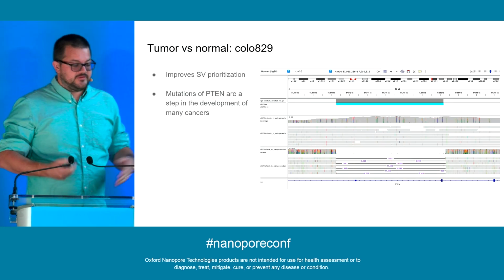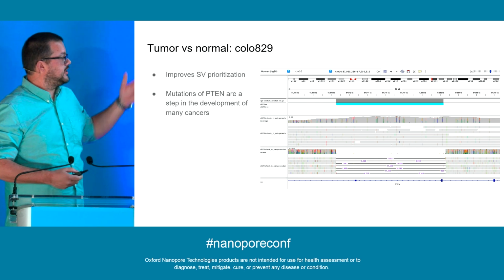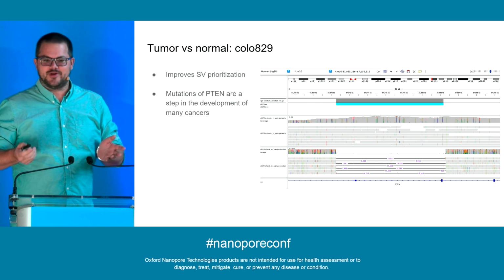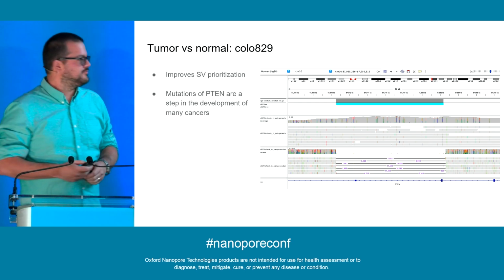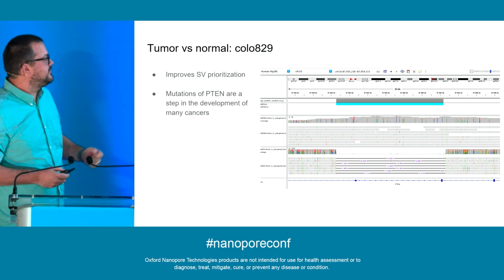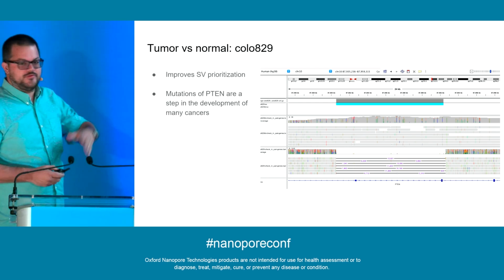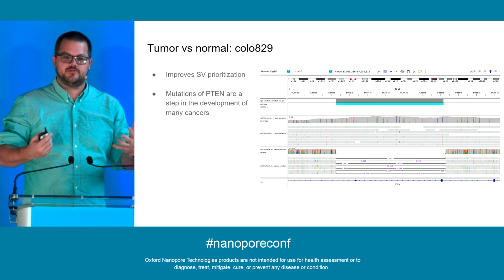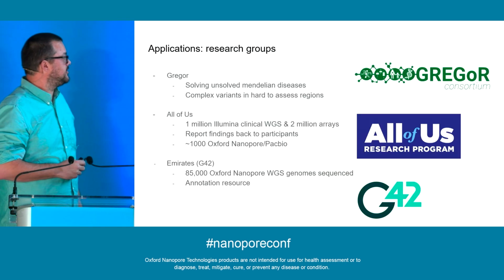For cancer studies, Sniffles detects mosaic and somatic mutations. There was just a talk today in the morning. We solved that bug, so it should be better and come out in the next month or so with the next release. But this is pretty straightforward, and within seconds, using the merging tool that I just described, it is now very straightforward to identify the somatic variants.